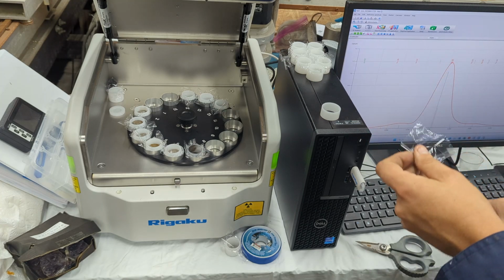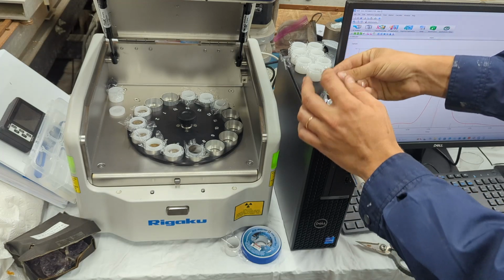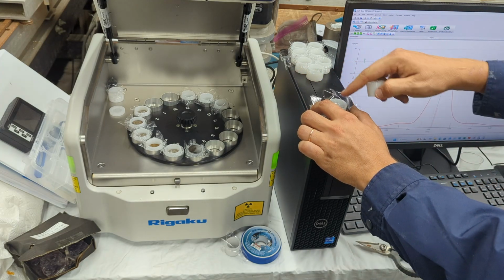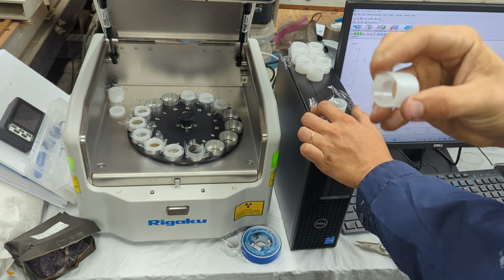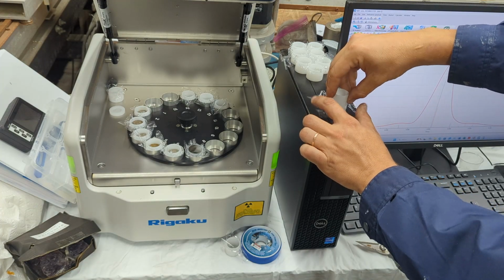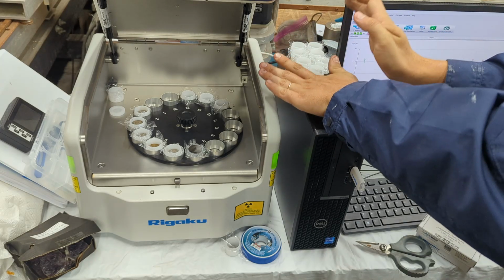Okay, you cut out a section on the cup. This is the ring, so you have a ring, and then you have this inside cup. Technically, you don't want to touch the centerpiece where you'll be measuring. This inside cup actually has a ridge on the top, and the bottom part is kind of cone shaped, and pretty much you aim it downwards and just push it down.